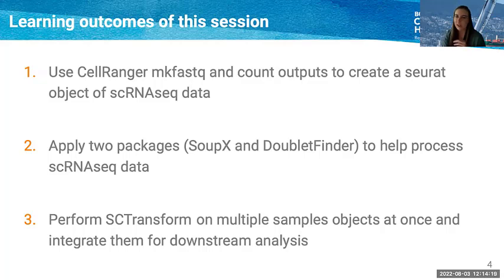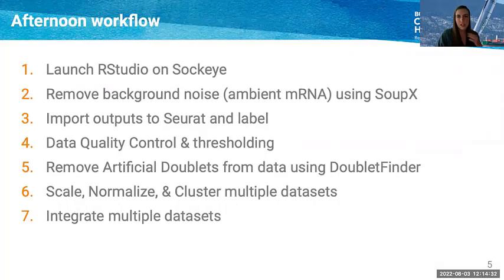Lastly, we're going to perform SCTransform on multiple sample objects that we make at once and then integrate those objects so they're all put together for downstream analyses and comparisons. Here's our afternoon workflow.